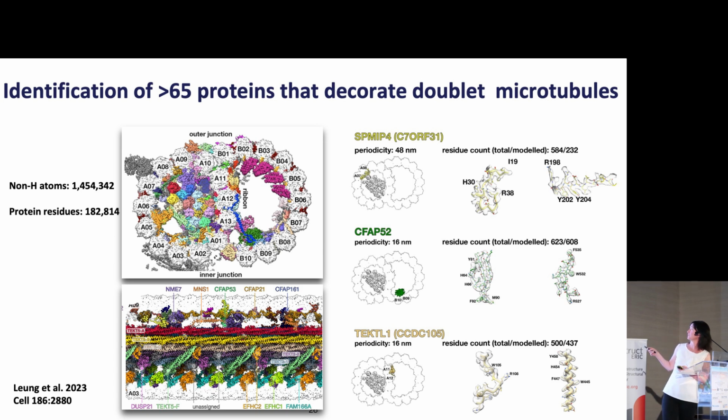What you see on the right is that it's still the case in the field that the reviewers really want you to prove, by seeing the map for each of these proteins that you identify. And I can tell you, for 65 proteins, it's a very big packet that you can get in our supplement. For each of these proteins, we had to create this.